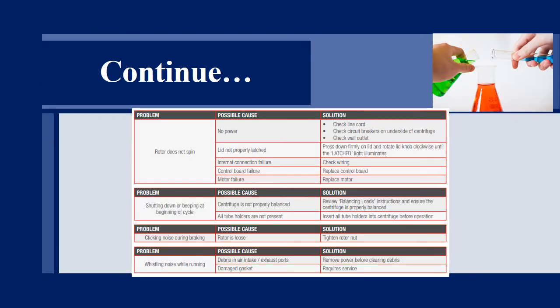Third problem that can occur in the centrifuge is the rotor does not spin. Maybe there is no power, so we have to check the line cord, check the circuit breakers and the wall outlet. Maybe rotor does not spin because lid of the centrifuge is not properly latched. Press down firmly on lid and rotate the knob clockwise until the latch light illuminates.